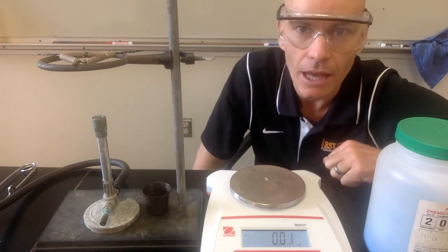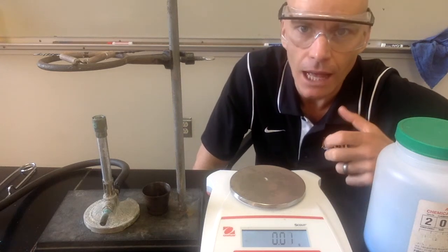Hey, what's up Marauders? Today we're going to be doing the hydrate lab. It's my favorite lab, so let's go ahead and get started.